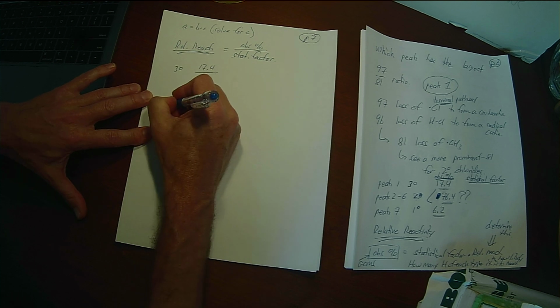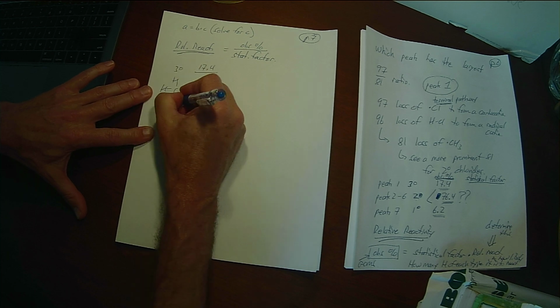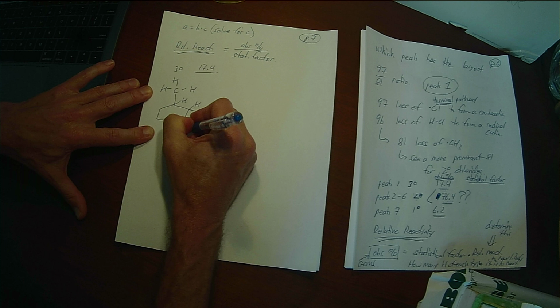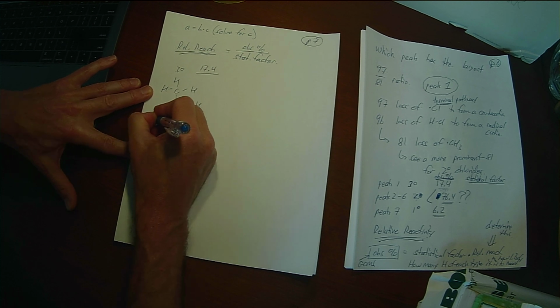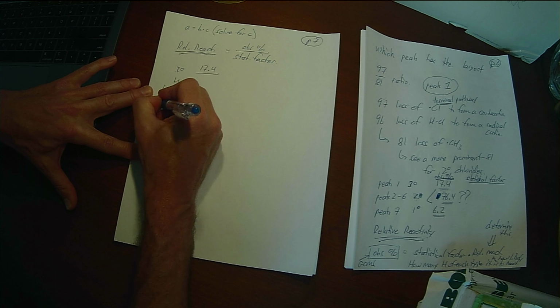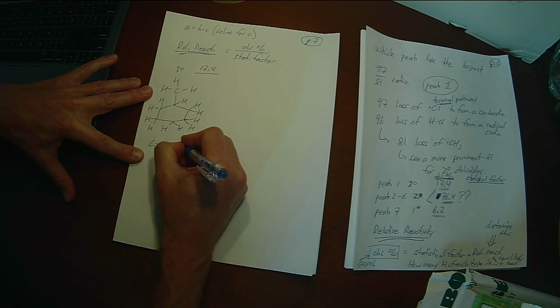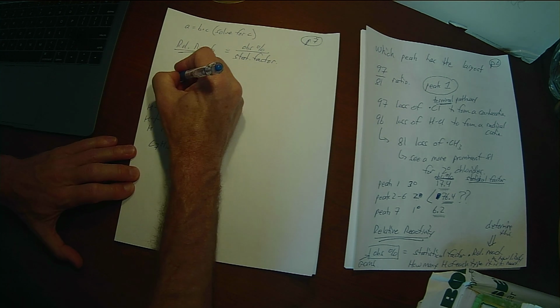So then it would be a good time to write the molecule out with all the hydrogens attached, so you make sure you count correctly. There's a total of 14 hydrogens, right? Because this is C7 and it has 1 degree of unsaturation, so it should be C7H14. Hopefully I drew 14 hydrogens.